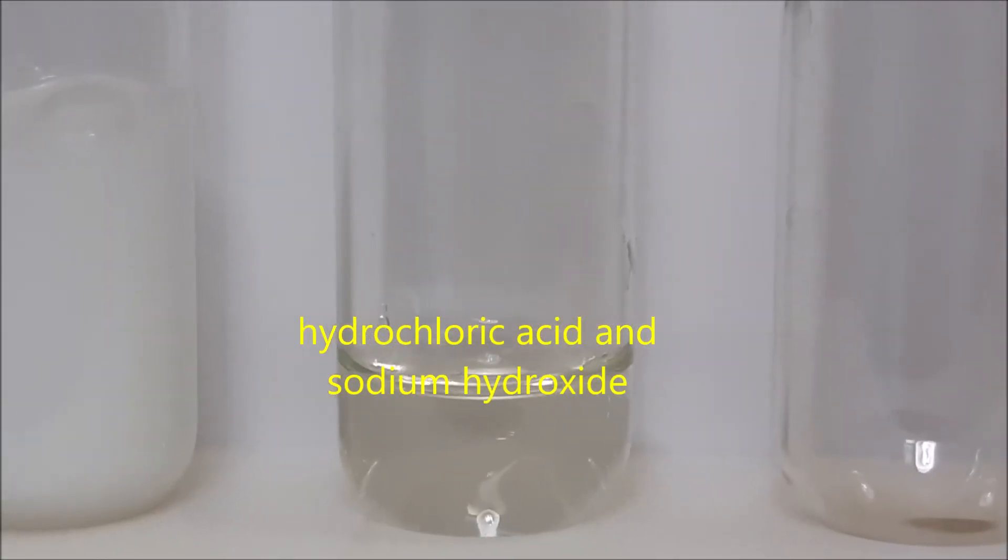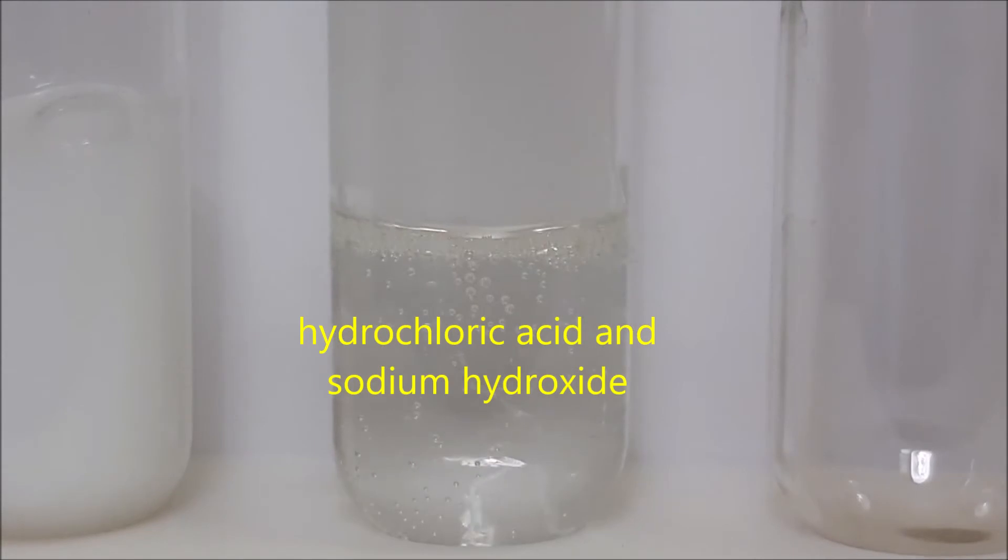For test tube number five, we have hydrochloric acid and sodium hydroxide.